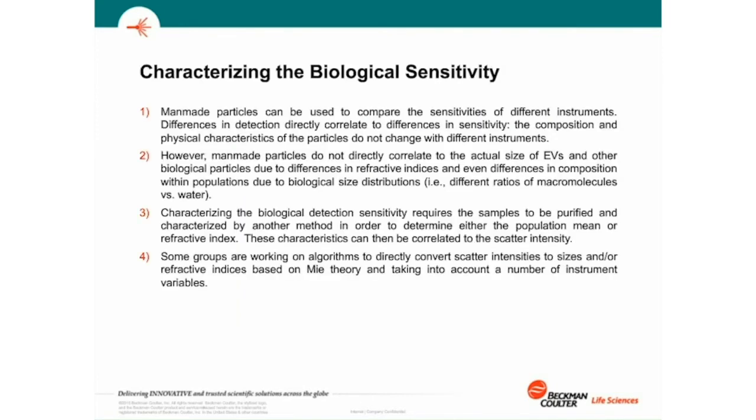Characterizing the biological sensitivity is a little more complex. Man-made particles can be used to compare the sensitivities of different instruments. However, their refractive indices don't directly correlate to biological particles. Biological particles actually can have a variety of refractive indices depending on the size.